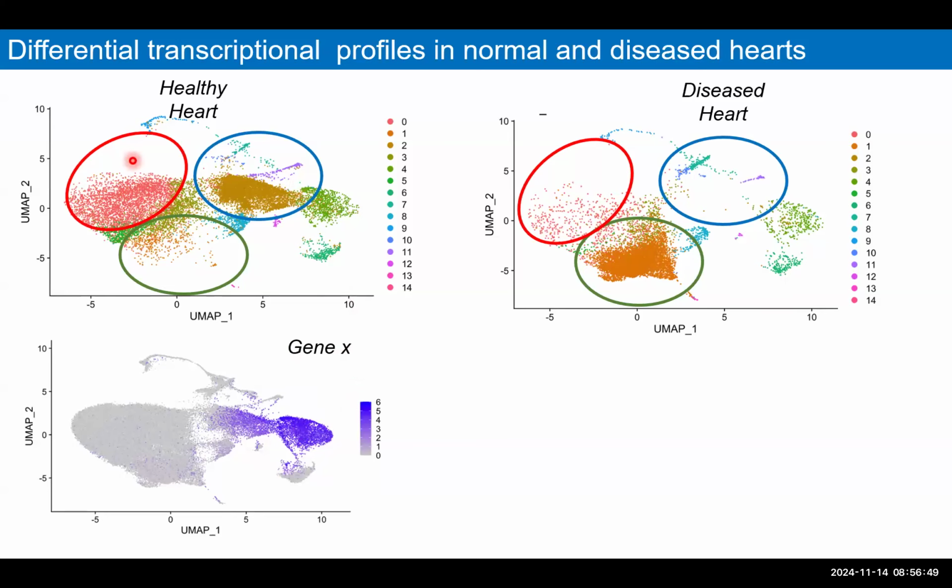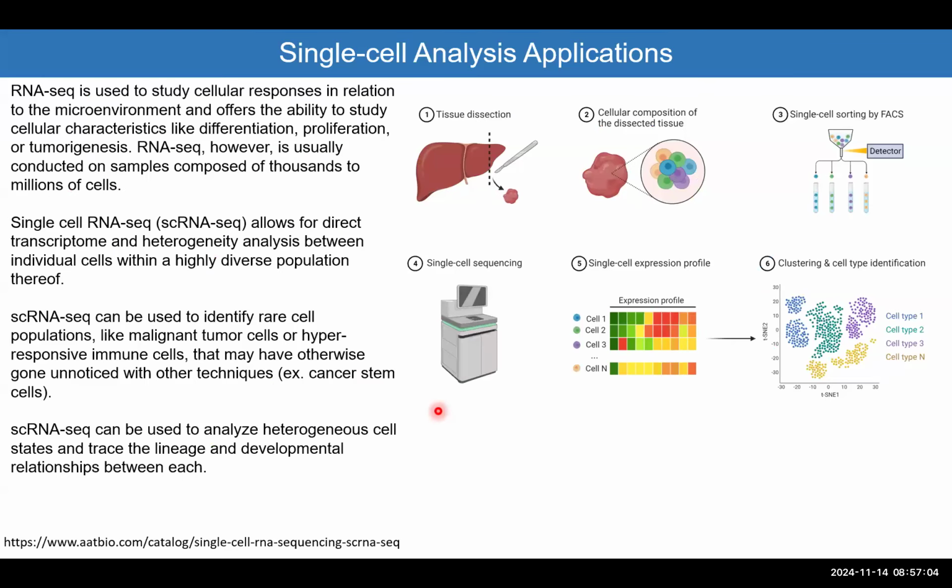And now, of course, for each of those clusters there are a lot of gene markers that I can check. So I would know what exactly this cell type is and what exactly this cell type is. So this is really a very, very high-end type of analysis.